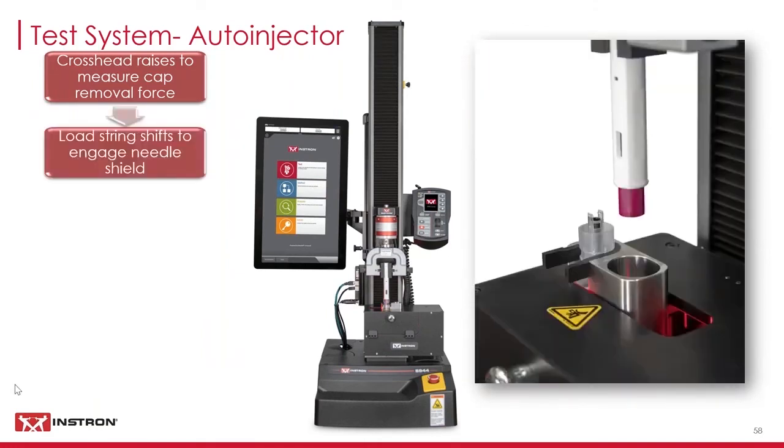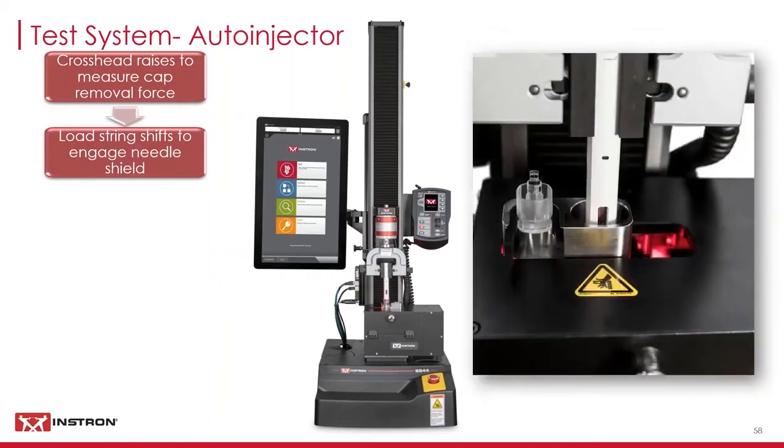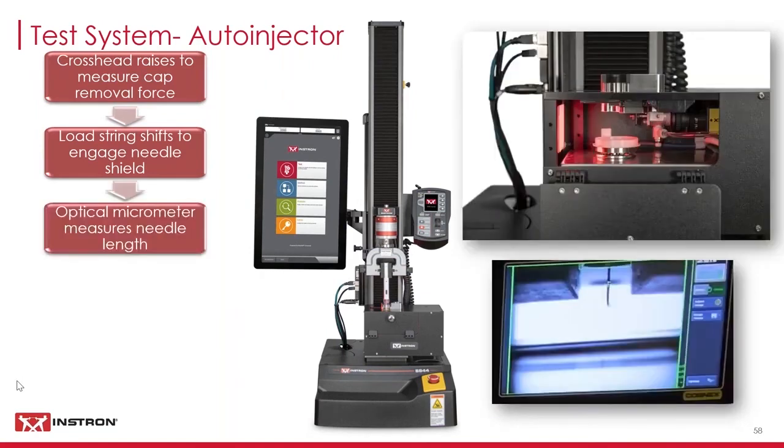the shuttle moves by pneumatic pressure, and the crosshead will move down to engage the needle shield. The software captures the activation force based on user criteria. Then the needle is released and the injection of medicine begins. The needle length is measured using an optical micrometer and is recorded in the software.